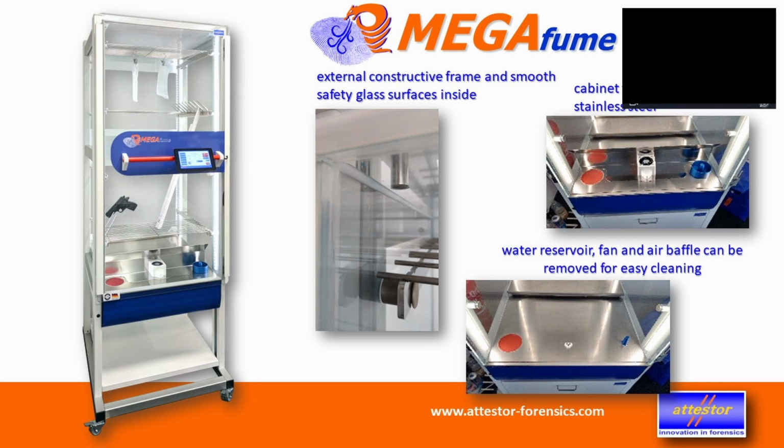And as you can see on the upper picture, on the left side, that red thing, that's the hot plate. Absolutely even. There is no edge around it or anything like that. And it's made in a size that you can utilize any type of glue dishes that you have. We found most of our customers do want to use different types of glue dishes, simply because that's what we have anyway in stock.